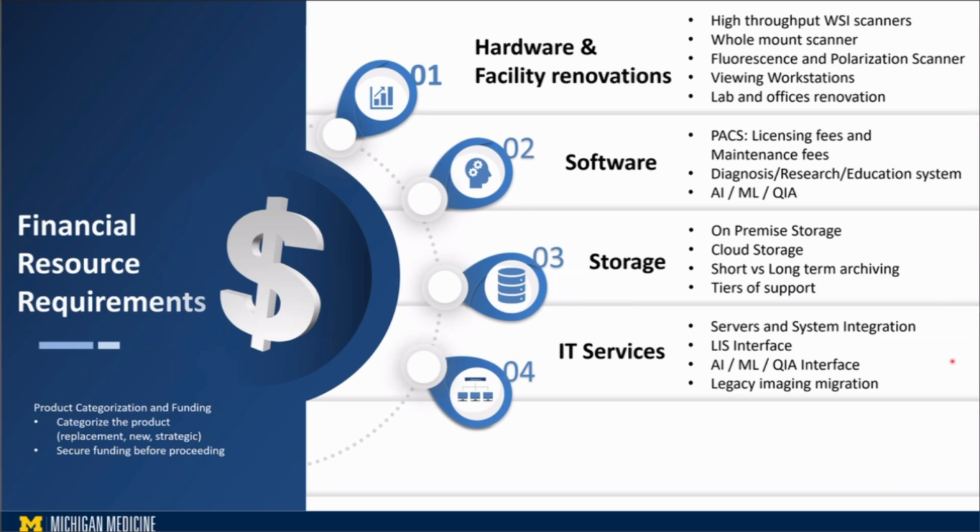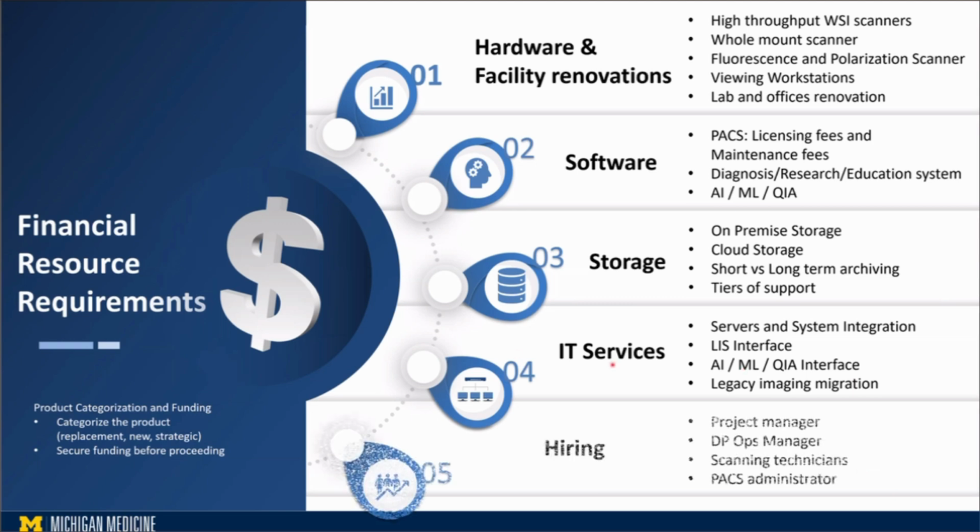IT services, as I said, integration with how many systems, whether you need an interface engine between your lab information system and the PACS, which is picture archiving communication system, AI integration through third-party API, if they have it or not. So there is a lot of things you need to consider.